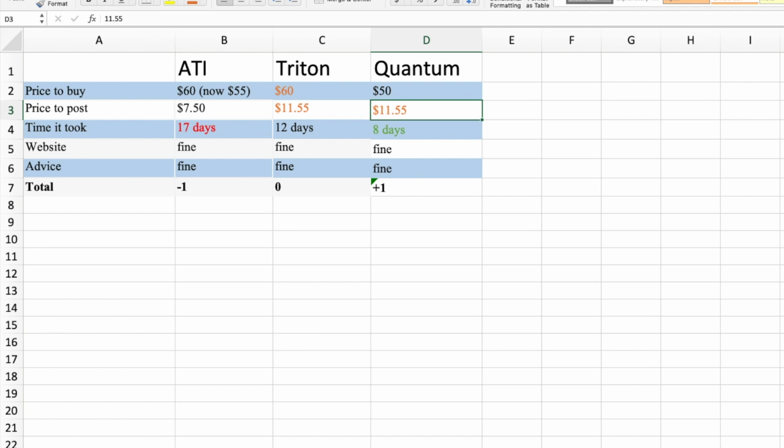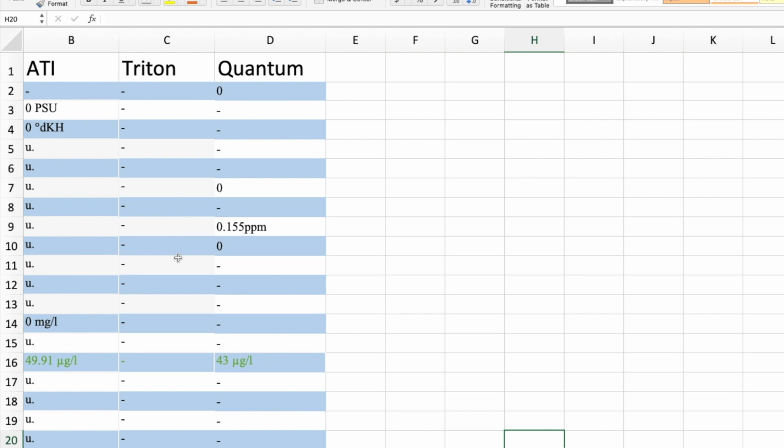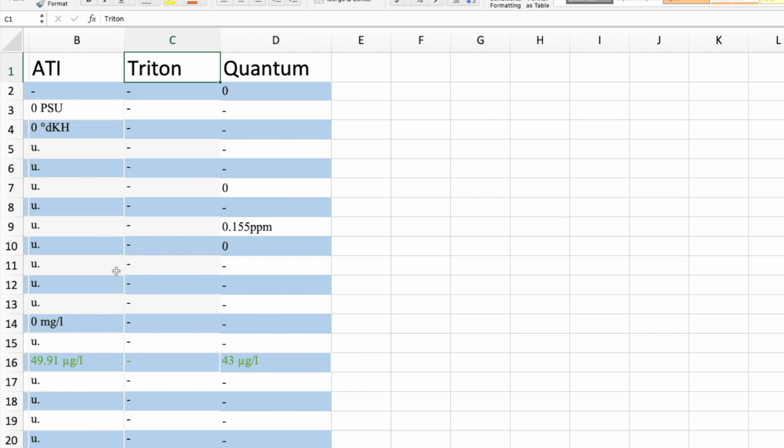So let's move on to RODI. Now, if I scroll to the top here, I'll quickly give away the results for a second, but first thing I'll point out, Triton don't do your RO, so you can see here we got the dash. They're not going to get any points here. ATI and Quantum both did the RODI, and to be honest, it's a handy feature, but I don't want to be too heavily weighted towards it. You basically want to know if your RO is clean or not.